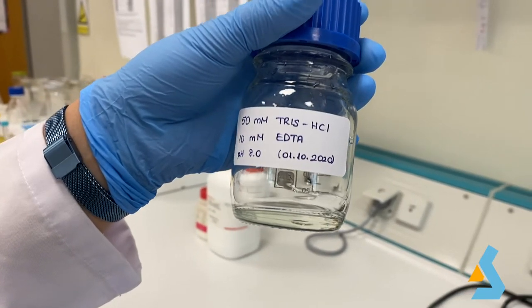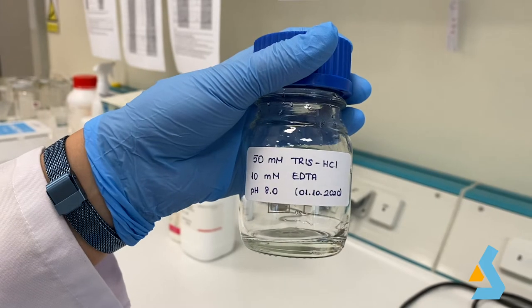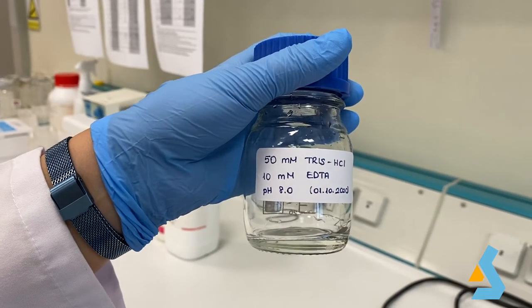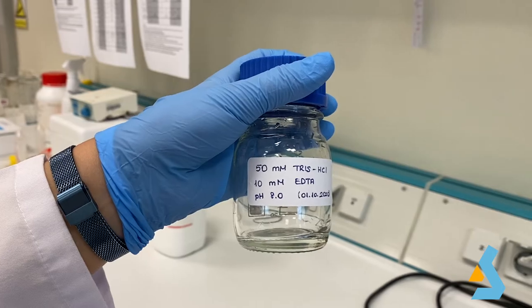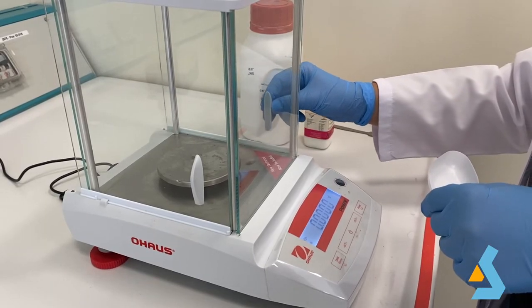There are many buffers which may have more than 10 components, thus it is critical to work meticulously when preparing buffers. You have to carefully calculate how much of a chemical you need to obtain the desired concentration of that chemical in your buffer.